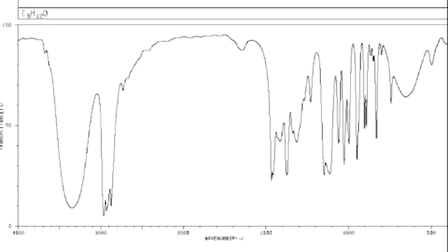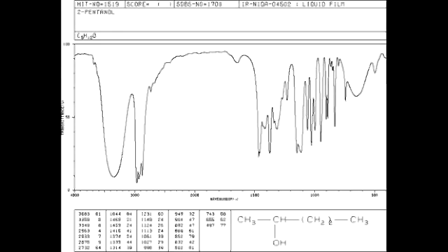Anyway, here we have an alcohol. You can tell that it's an alcohol and not an amine because we have a very broad, strong peak. The transmittance there goes all the way down to about 8%, whereas in the amine previously it was a much weaker peak around 3400. We also know that this molecule is once again totally saturated because there are no jaggedy peaks on the left side of 3000, like around 3050. They're all to the right. Looking at the molecule and the name here, we can see that we are in fact correct. It is an alcohol and it is totally saturated, and in fact this molecule is 2-pentanol.